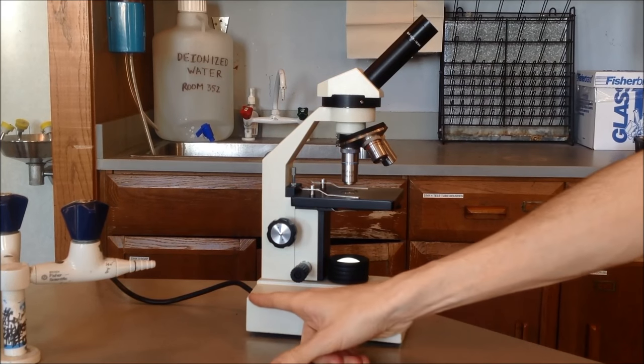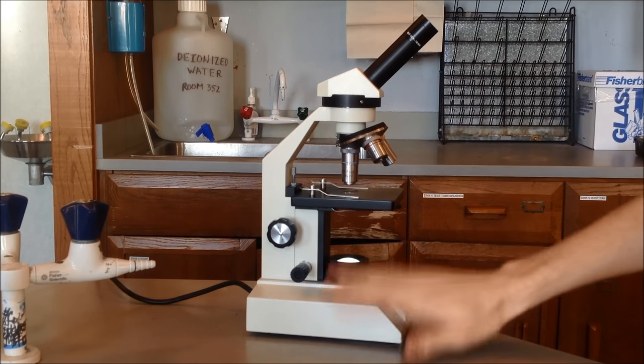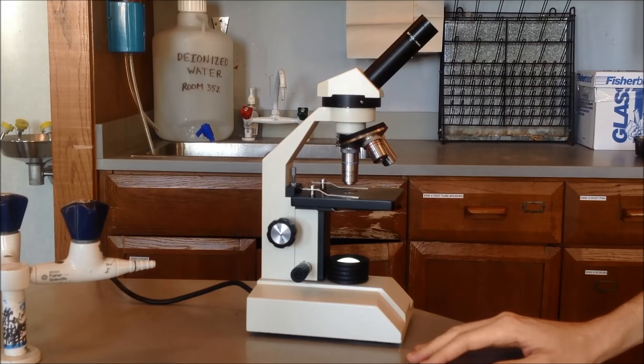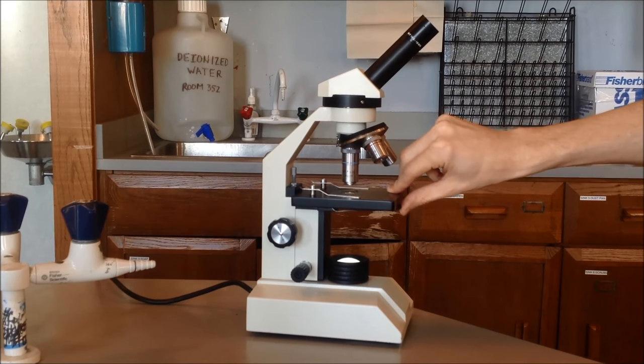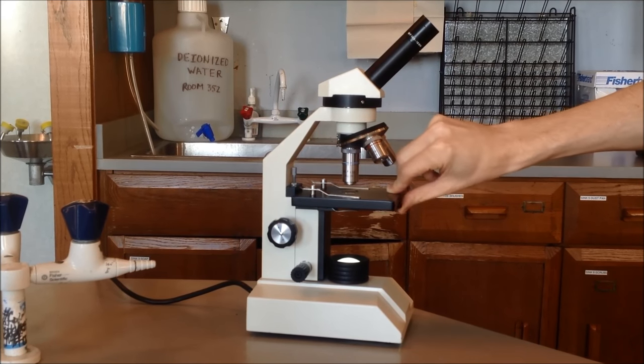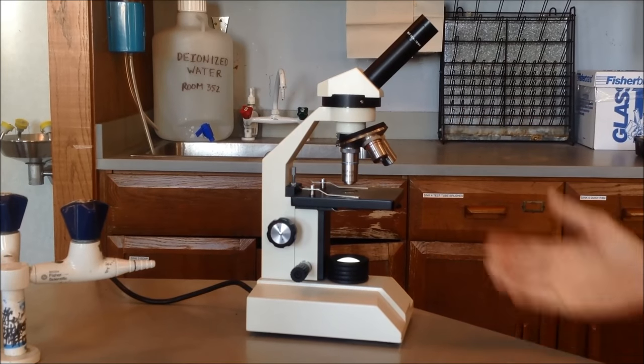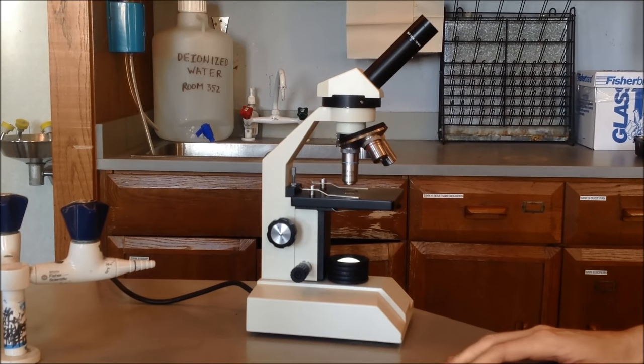The base is this thing right here. That's the base. The diaphragm, I'm going to change your angle of the camera here in a second and give you a better view of the diaphragm. But the adjustment for the diaphragm, to change it, is a little thing right here. It's just a little disc that you can move like so. And I'll show you what that's actually doing when we take a look at underneath the stage.